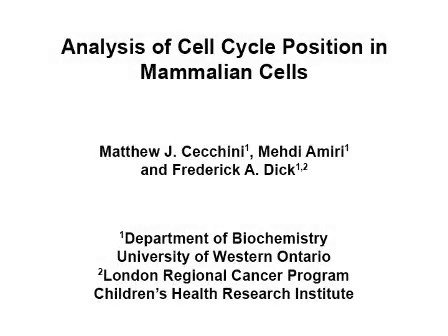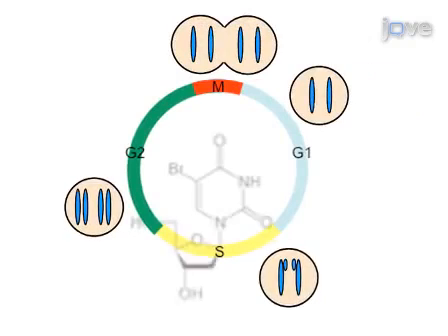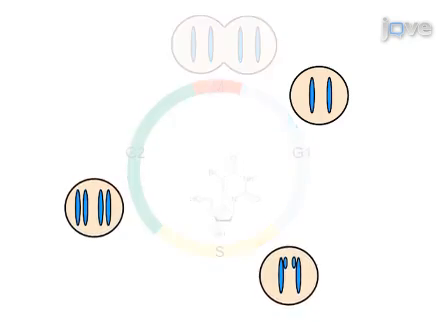The aim of this procedure is to be able to determine the proportion of cells in the different phases of the cell cycle. This is accomplished by first adding the cell proliferation labeling reagent BrdU to a viable cell culture for incorporation into newly synthesized DNA.